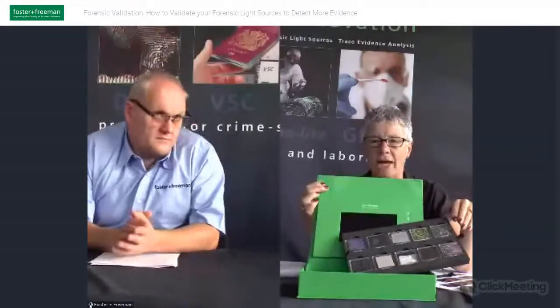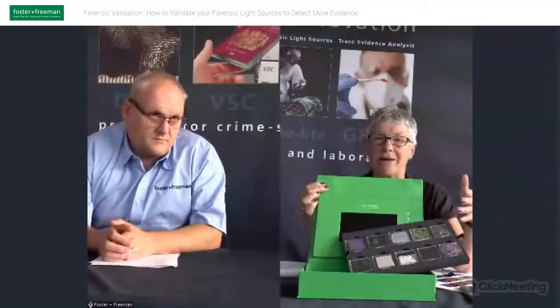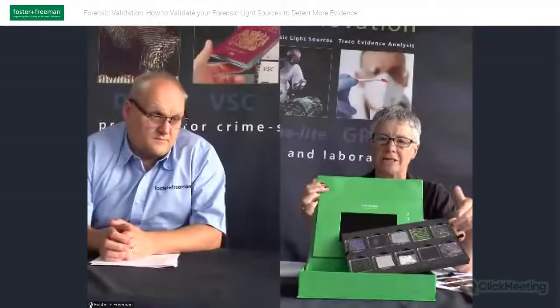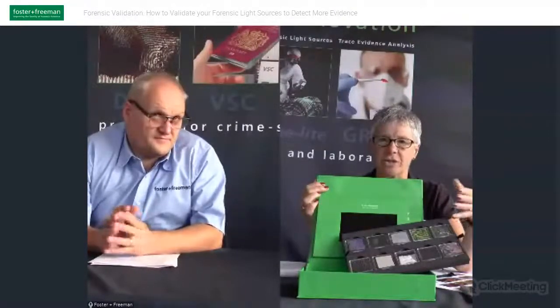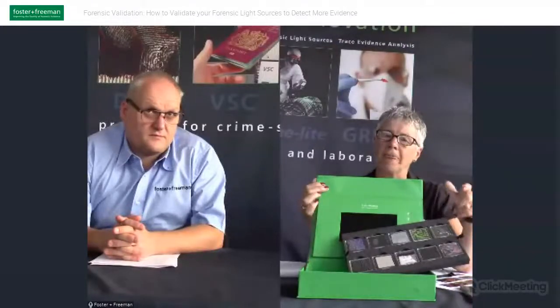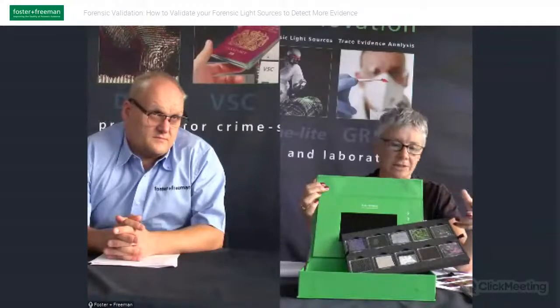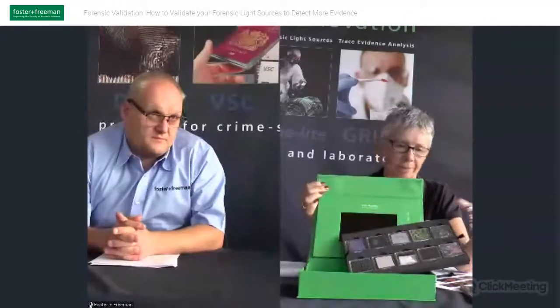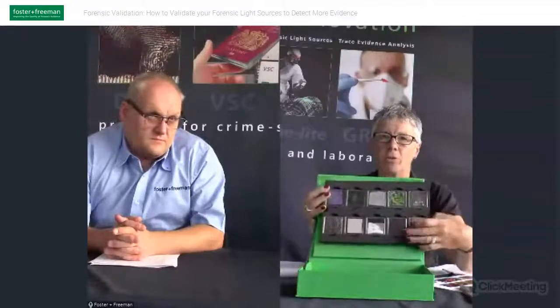Because of the Tissues Act, we're not able to freely send body fluids around the world, and we're aware that there could be an aspect of infectious diseases, certainly, although they're dried stains. It's the safety aspect. Also with the accelerant, it could be dangerous to send real accelerants, the same with perhaps gunshot residues, and of course we can't send drug samples. So we've got a simulated drug sample in the form of washing powder here, this sample here.